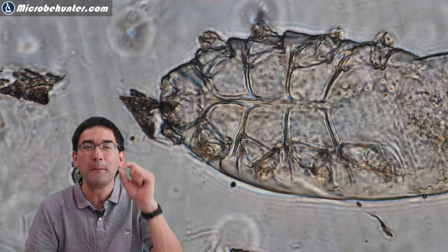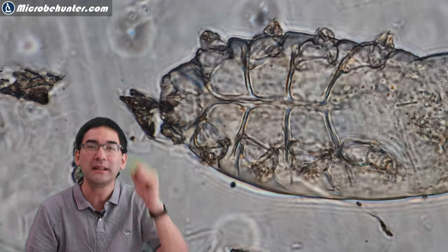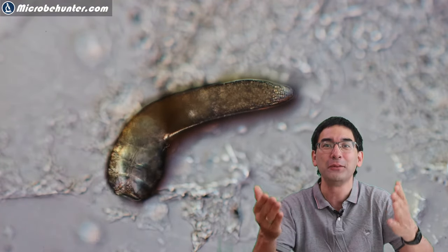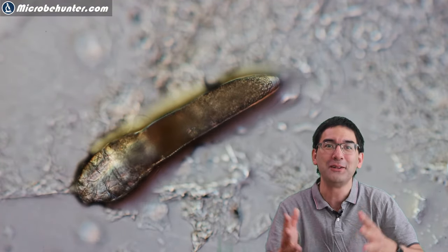Those face mites are microscopic little animals that live in the skin. What I have done is put some tape over my skin, and on the tape there are those little face mites because they like to crawl out during the dark. They get stuck in the tape, and when you put it under the microscope you're able to see them.